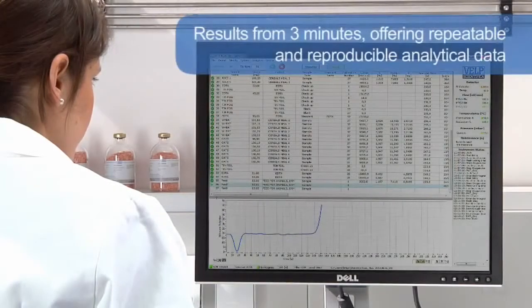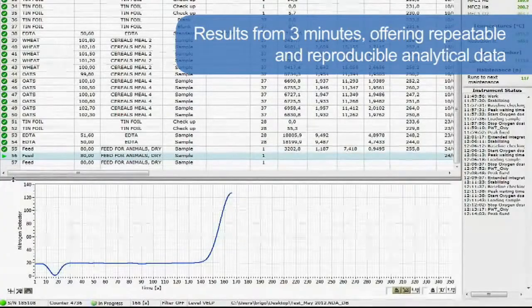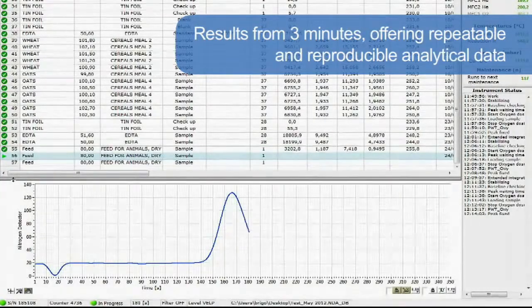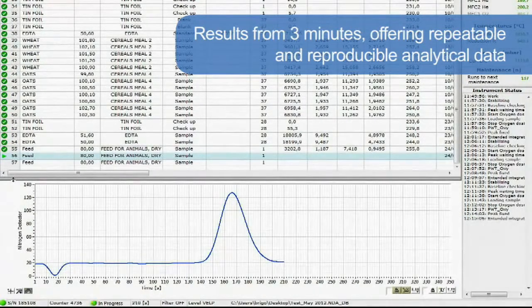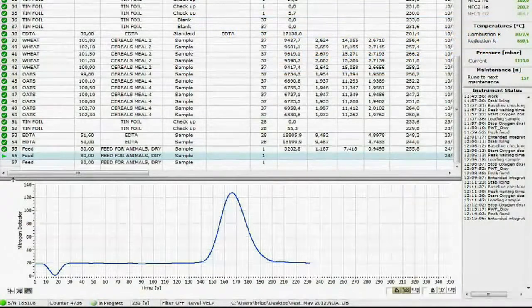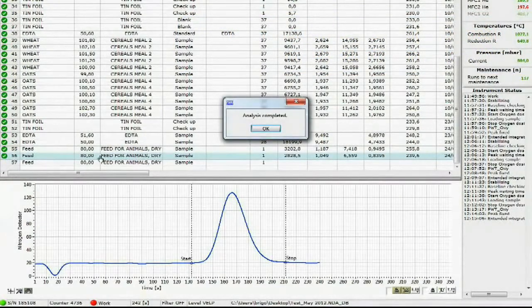The analysis time starts from 3 minutes, offering repeatable and reproducible analytical results on several types of samples with no matrix effect in the determination of nitrogen. To increase the precision and accuracy, all the gases are tested.